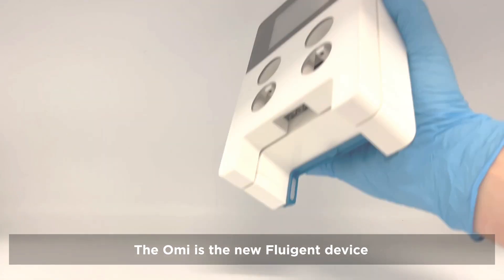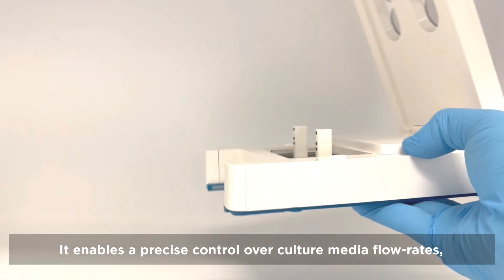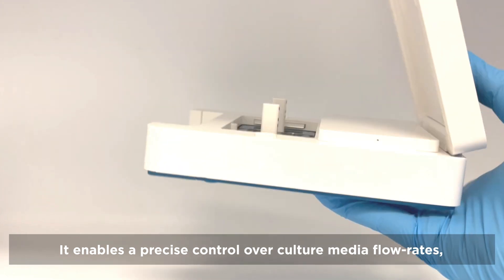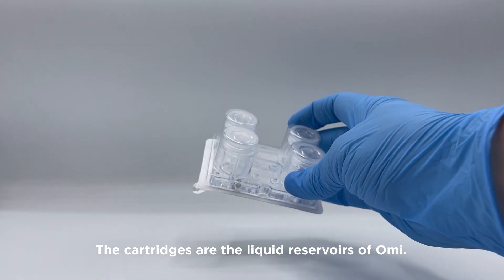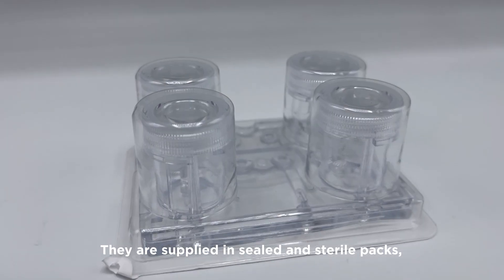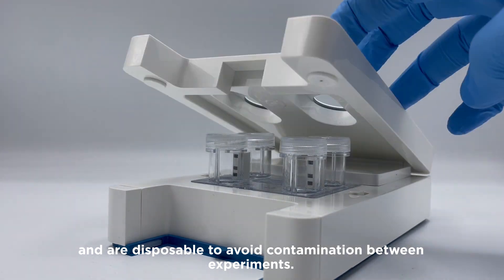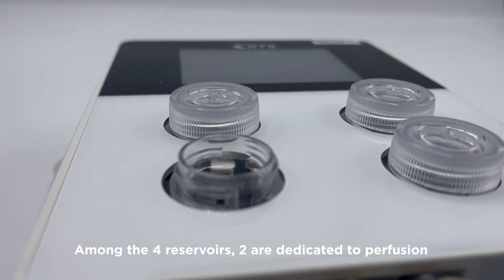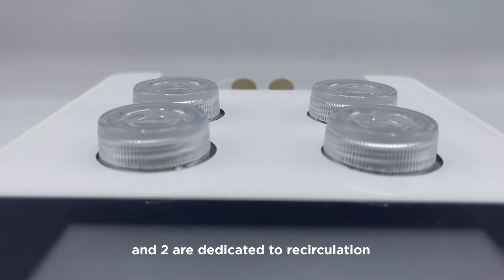The OMI is the new Fluigent device dedicated to cell culture and organ-on-a-chip studies. It enables precise control over culture media flow rates, allowing for both perfusion and recirculation. The cartridges are the liquid reservoirs of OMI. They are supplied in sealed and sterile packs and are disposable to avoid contamination between experiments. Among the four reservoirs, two are dedicated to perfusion and two are dedicated to recirculation.